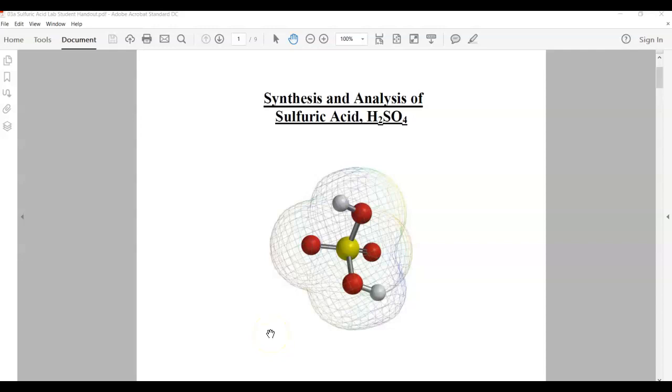Hello. The purpose of this video is to try and give you an introduction to the sulfuric acid synthesis lab experiment that we're going to do so that you'll be able to fill out the pre-lab assignment first of all, and then just have a general idea of what's going to happen when we get to class on the day that we do the experiment, or at least the day that we start the experiment.